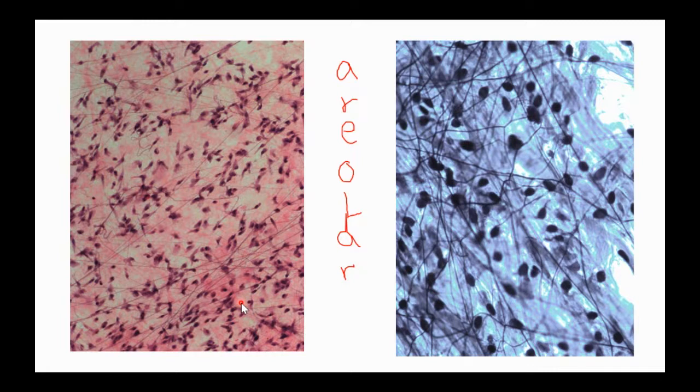This is another one, by the way, that we're going to find in the skin. Yes, Elapina's correct. There's a part of the skin called the papillary layer. This is the layer that's right underneath the outside of your skin, right underneath the epidermis. I'll show you at the end of our class today exactly where we find areolar loose connective tissue, but that's another one that we find in the skin. So make sure we can identify it and we know where it's found, because it's going to come up two weeks in a row.